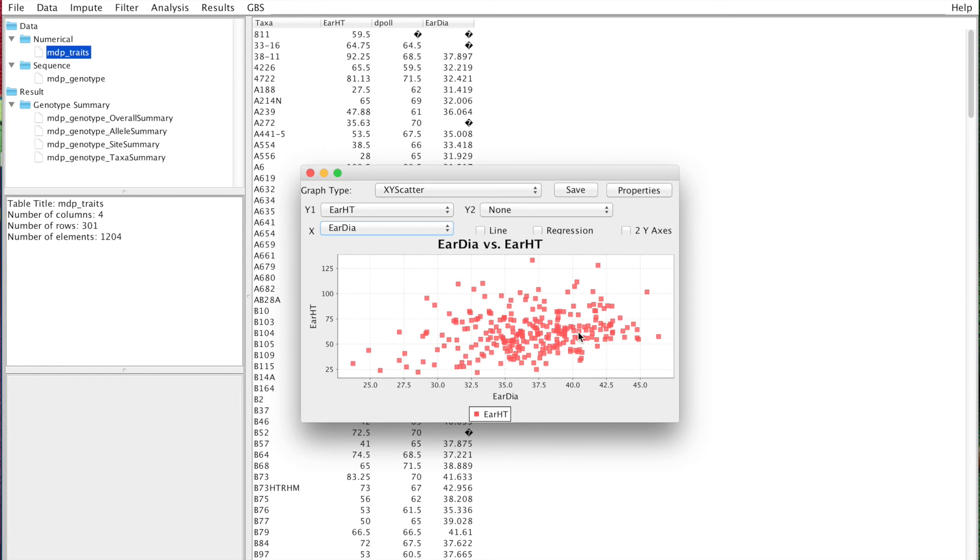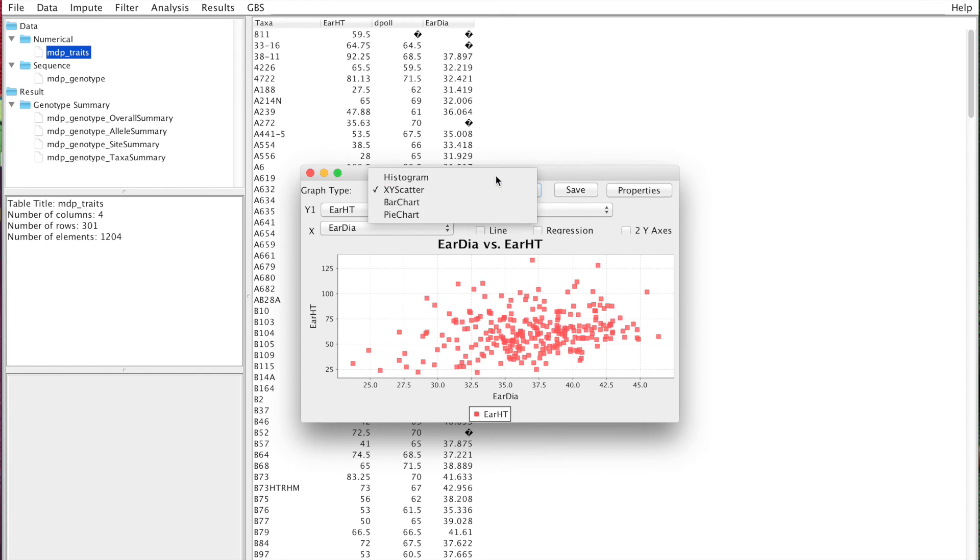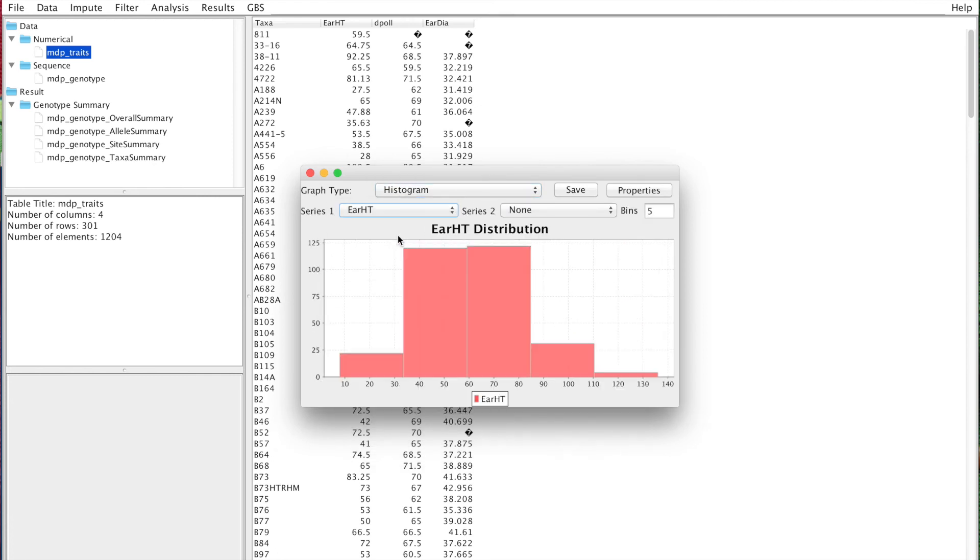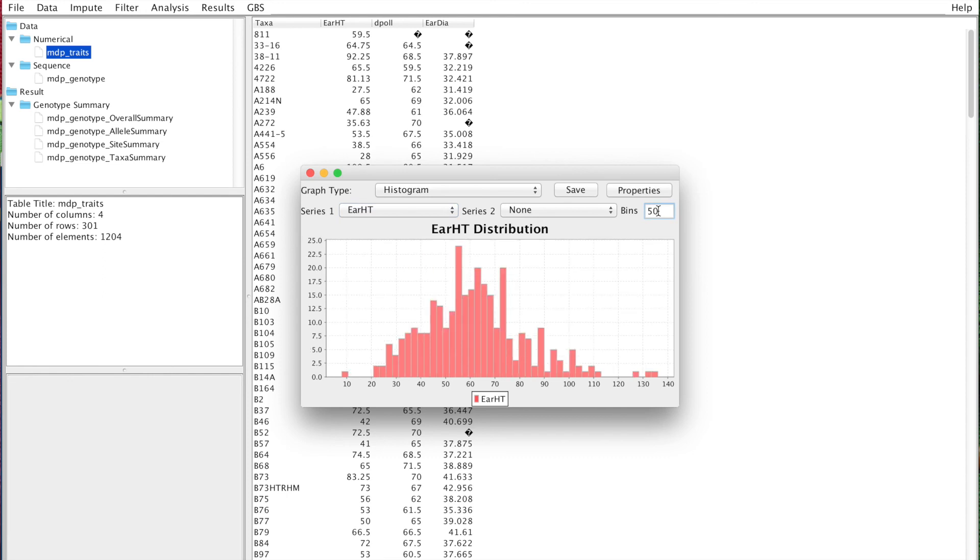the data is not normally distributed, and that's going to be really important. Here we can do a histogram of ear height. You can see that it's fairly well normally distributed, and that's going to have an impact in the downstream analysis.